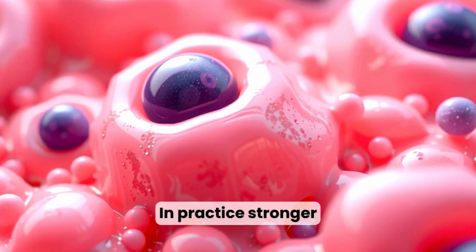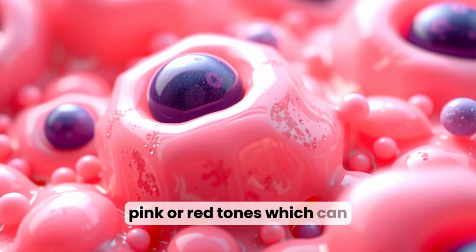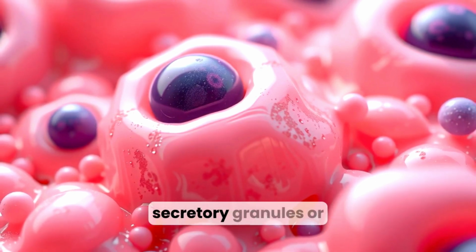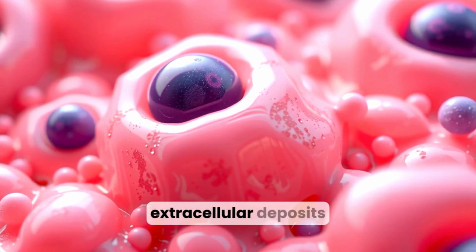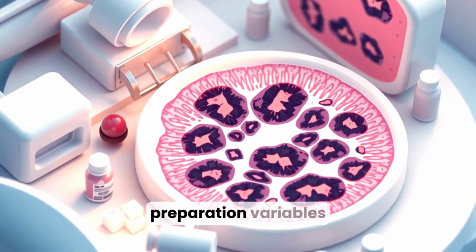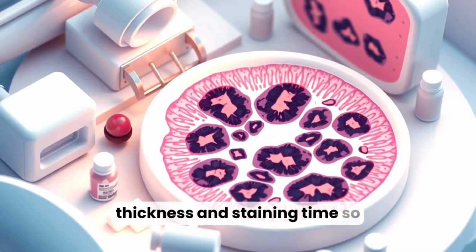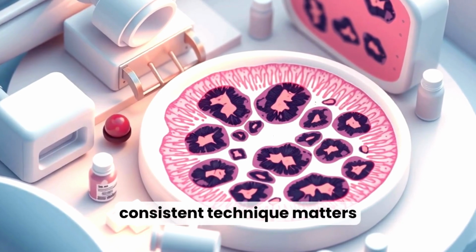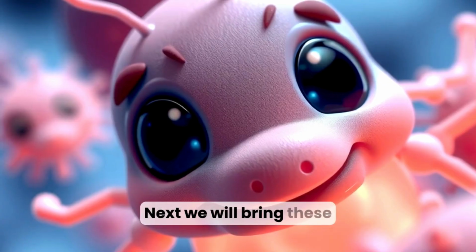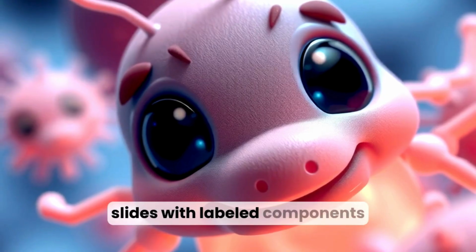In practice, stronger eosinophilia appears as deeper pink or red tones, which can highlight areas like muscle, secretory granules, or extracellular deposits. Remember that staining intensity depends on preparation variables, including fixation, section thickness, and staining time, so consistent technique matters. Next, we will bring these elements together and look at how to interpret whole H&E slides with labeled components and close-up views.